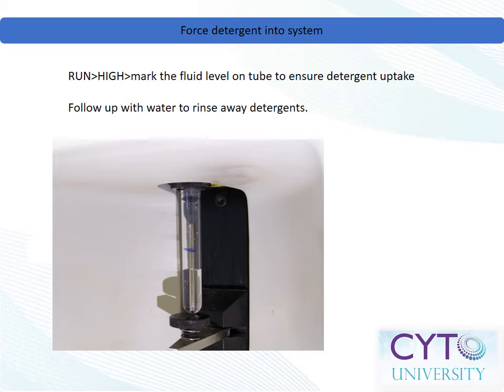If a back flush procedure doesn't unclog the instrument, it may be necessary to force detergents or other cleaners into the system. Always use detergents or cleaners that are compatible with your instrument. Install a tube filled with cleaning solution on the sample injection port and mark the fluid level on the tube. Run the instrument at maximum sample injection rate for several minutes and observe if the liquid has moved from its original line.